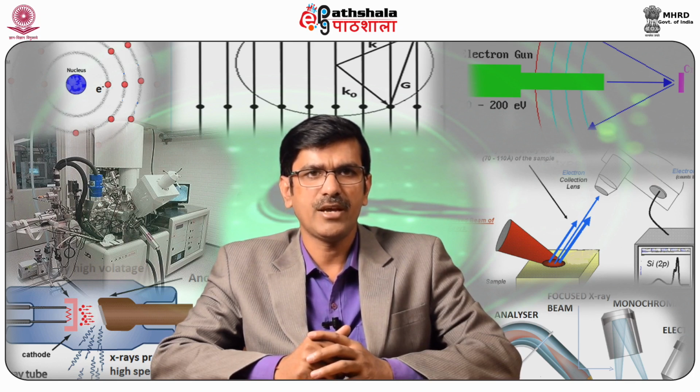It is a very expensive technique. It requires a large area for samples. XPS takes much time for sample analysis, generally 30 minutes to 8 hours per sample.